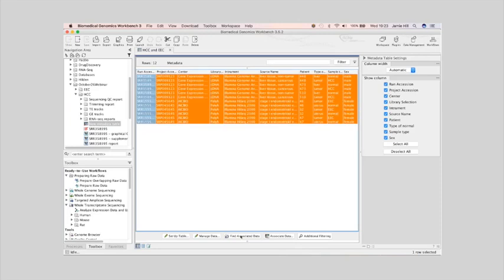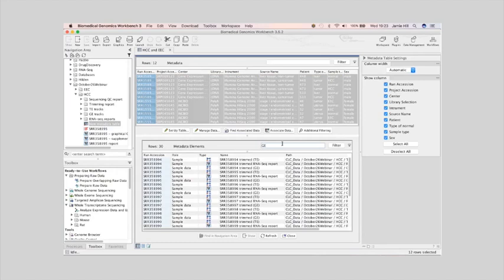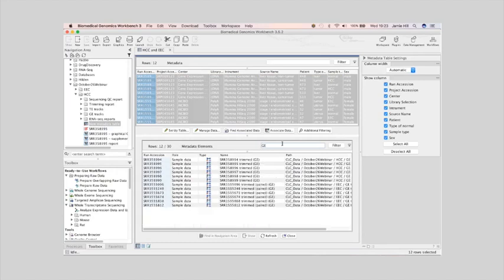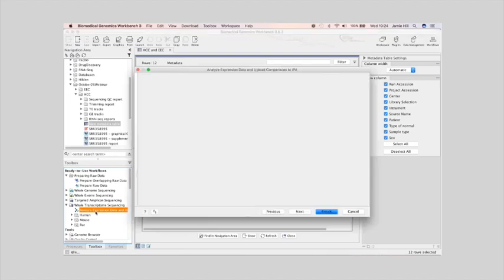And I've run the trimming, and I've run the RNA-Seq tool on all of these already. And so I've got a lot of different outputs. But what I'm going to do is focus just on the gene expressions, the list of gene expressions for each sample, and I'll select them all. And then this workflow here is the final piece of bioinformatics in this presentation. But of course, then I need to explain what you're actually seeing once I've run it.